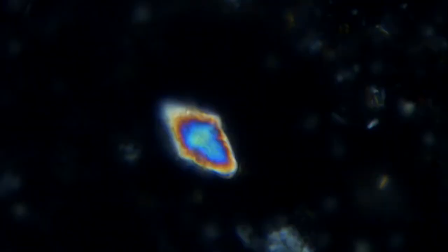This means that its thickness changes, like this element of Ascidian spicule, thinner in the borders with whites of first order, and then towards the central part of the element gradually attains blues of second order, which indicate a higher degree of retardation between the extraordinary and the ordinary rays.